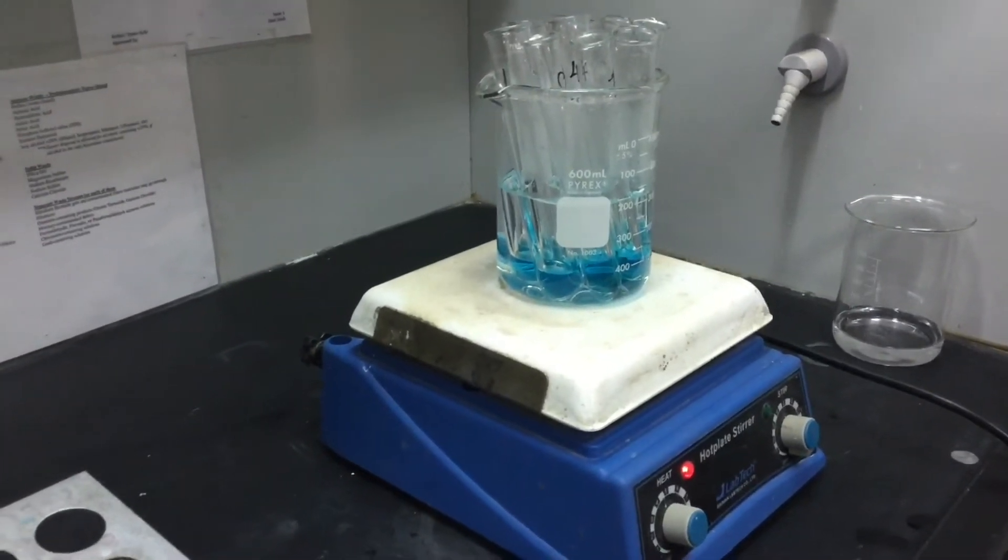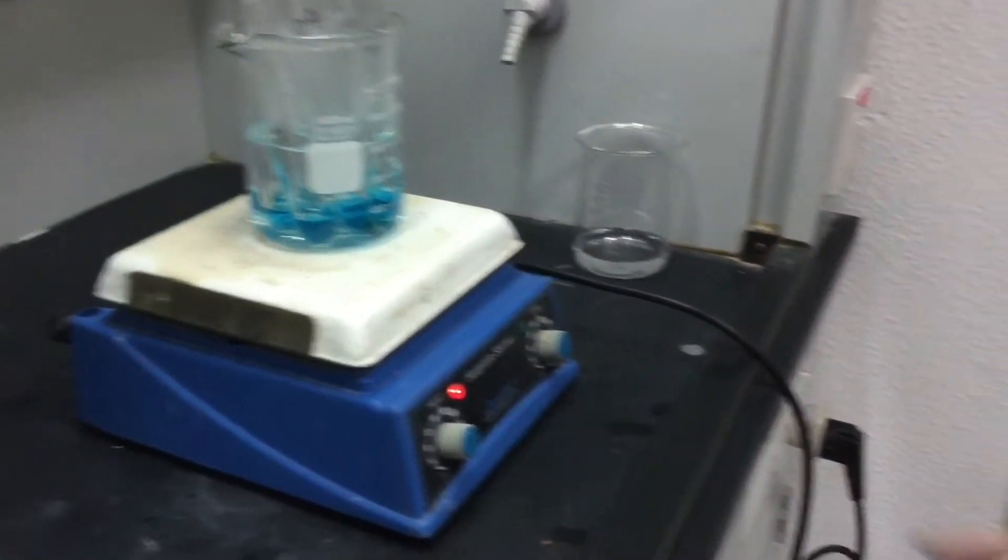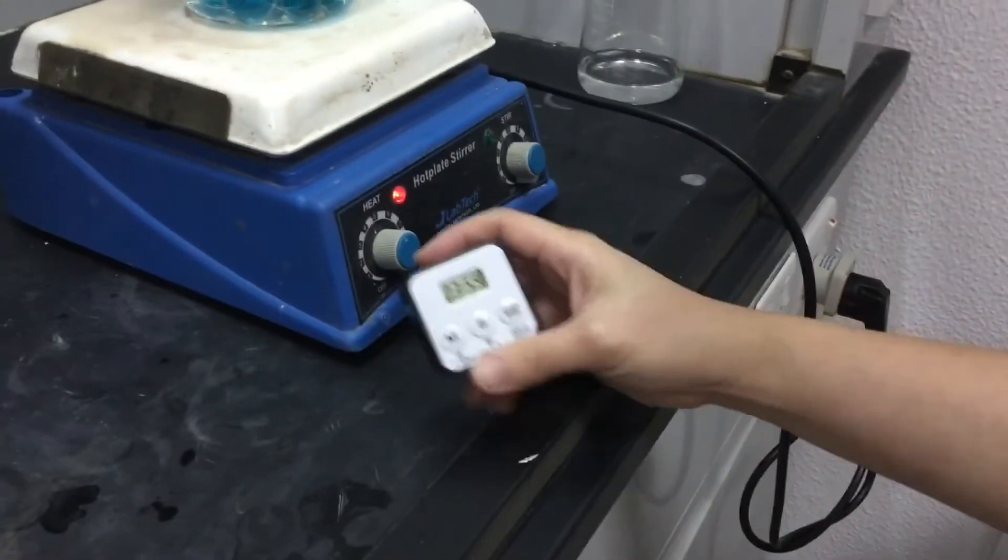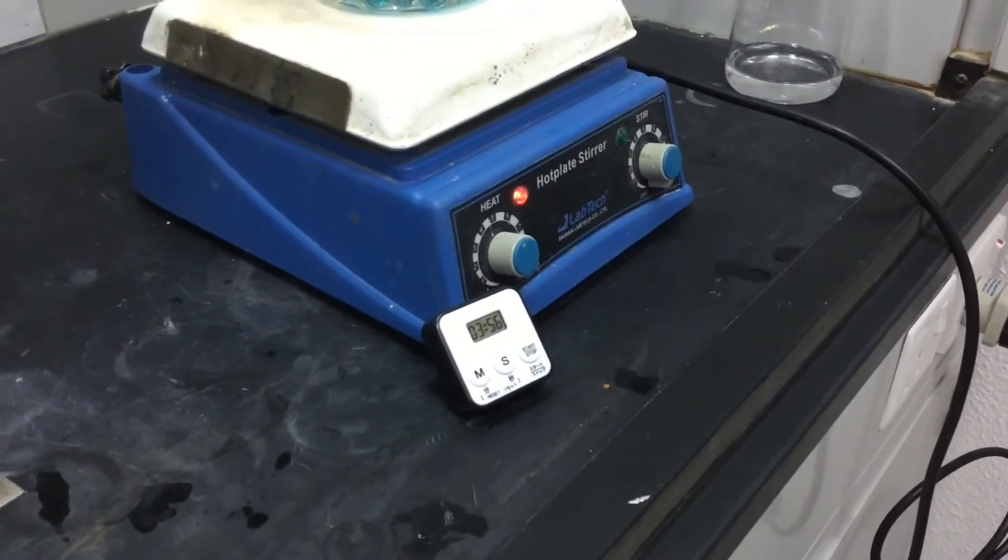After five minutes in a boiling water bath I remove the tubes, I allow them to cool and the fine precipitate that may have formed is then allowed to settle.